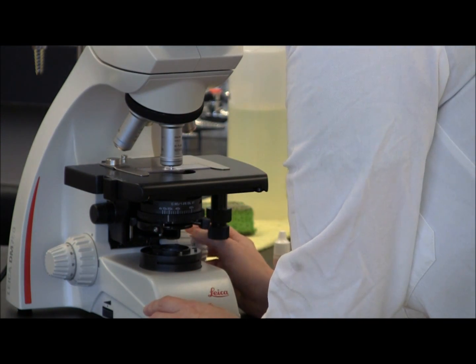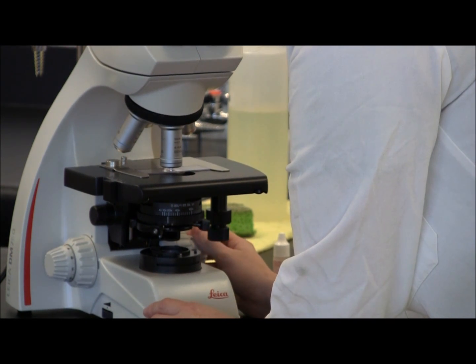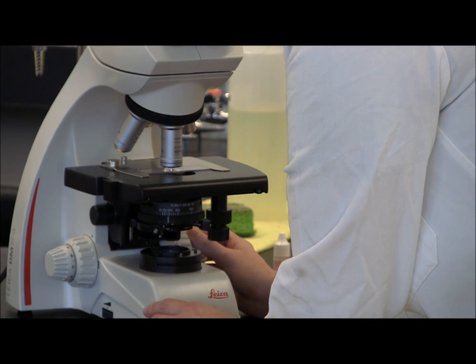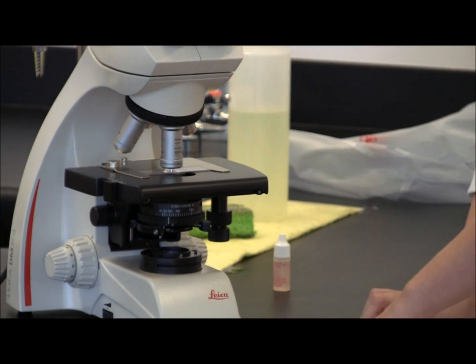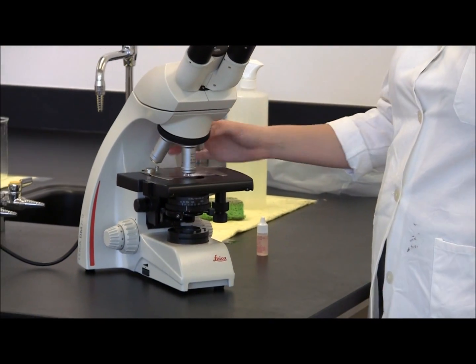Now that we've done that, we're going to use fine focus once again to bring our specimen into focus as clear as possible. Once you've done that, you can look at your specimen and call your TA over to check your work.